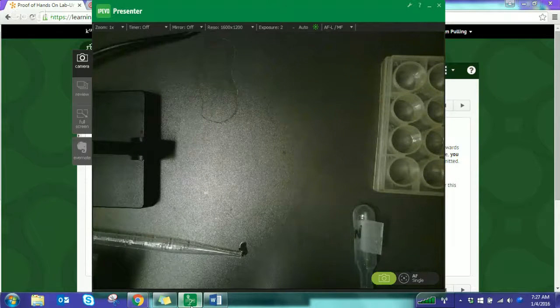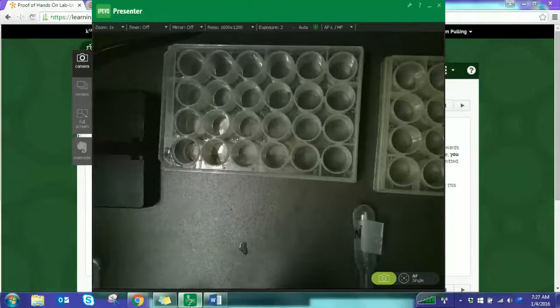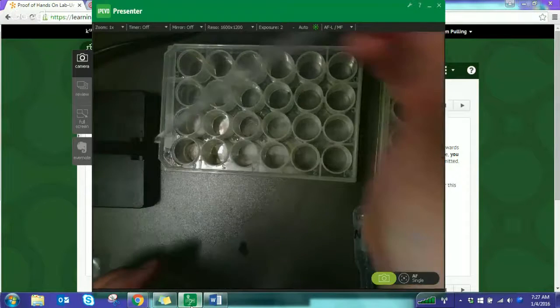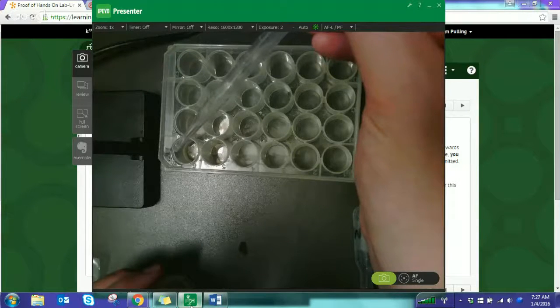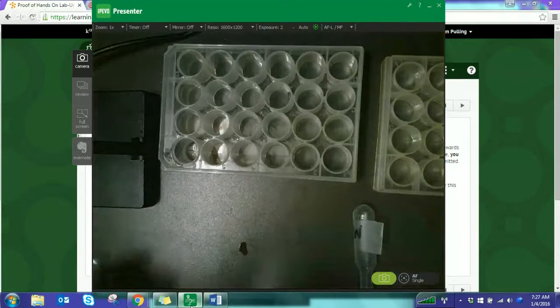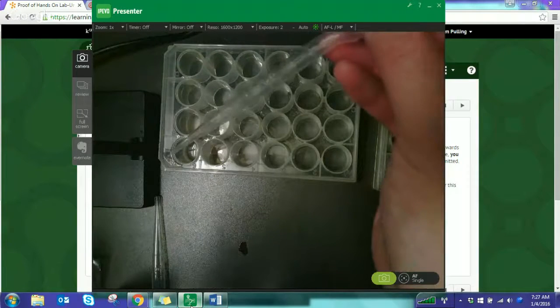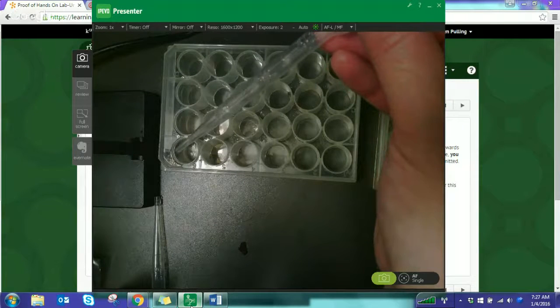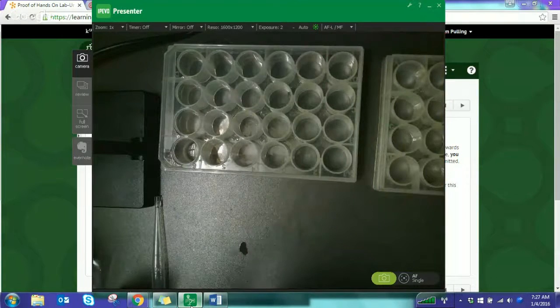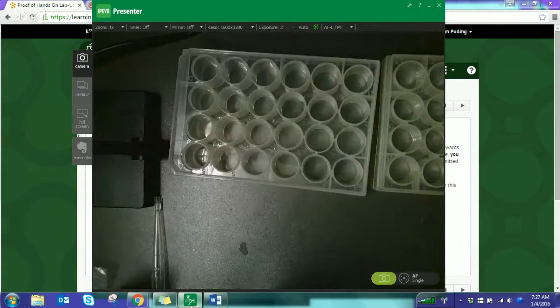So instead of paying attention to their half pipette rule, what I want you to do is get some alcohol in your pipette and then just do 5 drops. 1, 2, 3, 4, 5 drops of alcohol, and 5 drops of water. In every single vial, we're going to have a total of 10 drops. All right, so that first one is half water, half alcohol, so 5 drops, 5 drops.